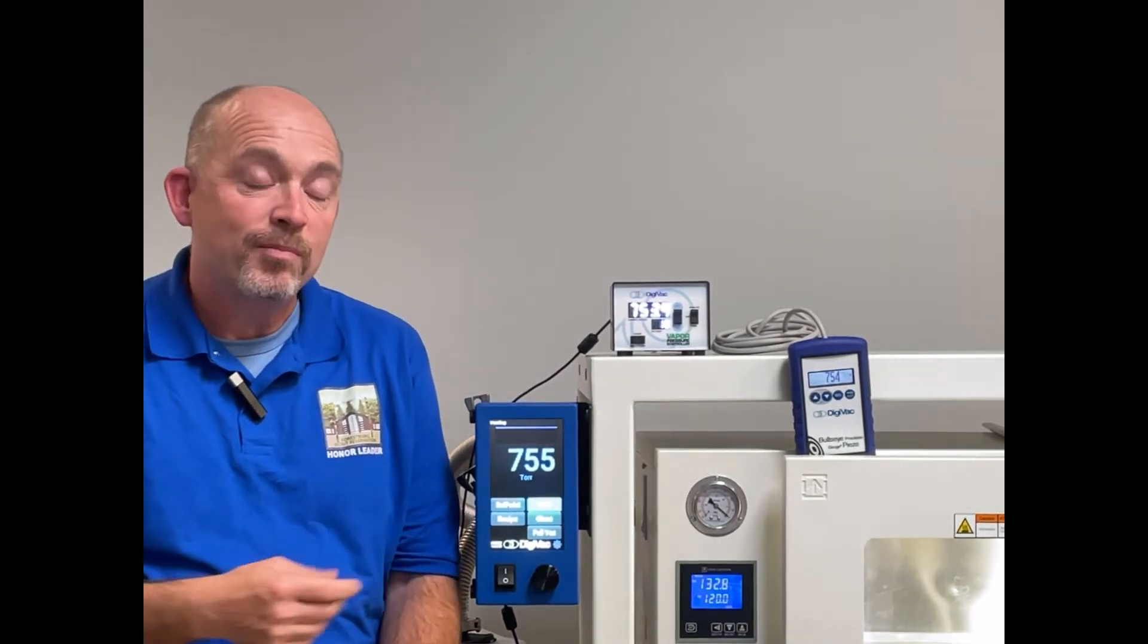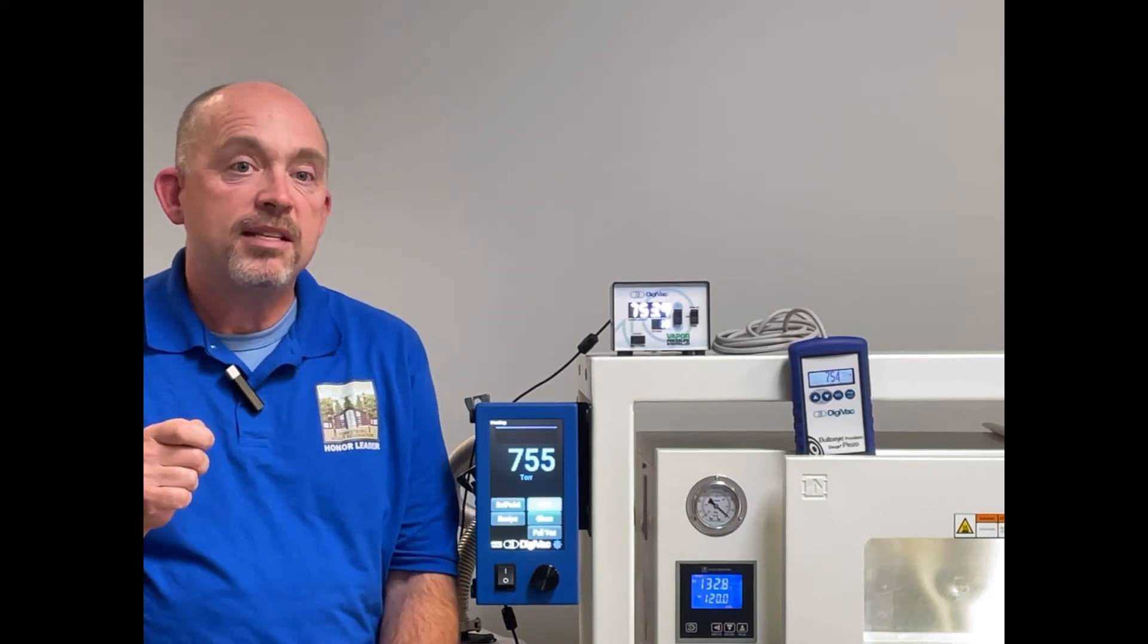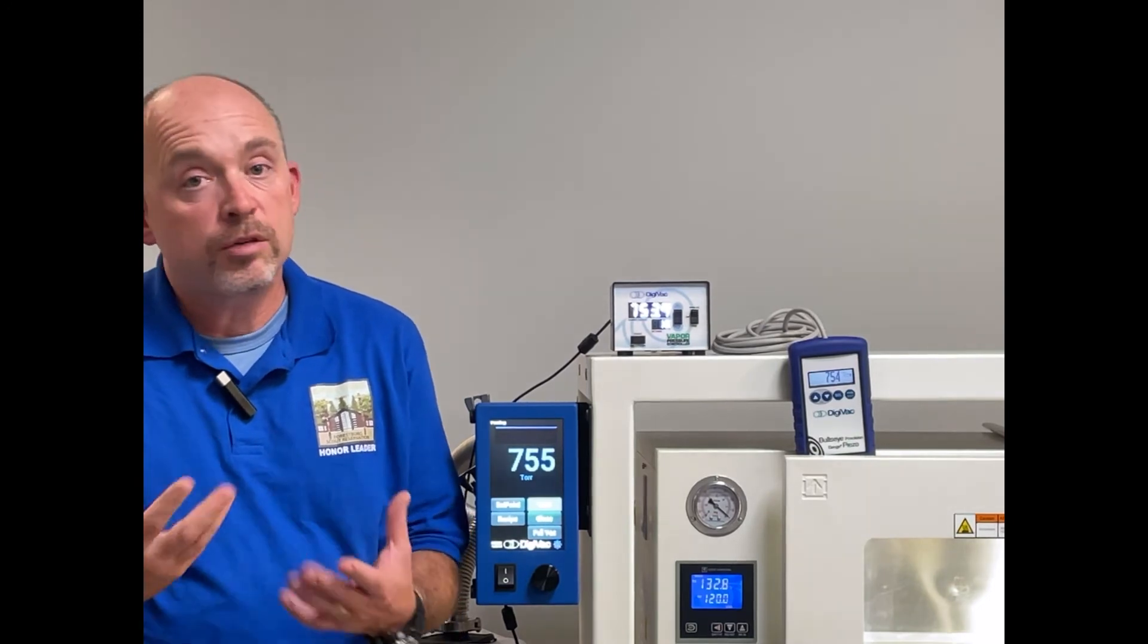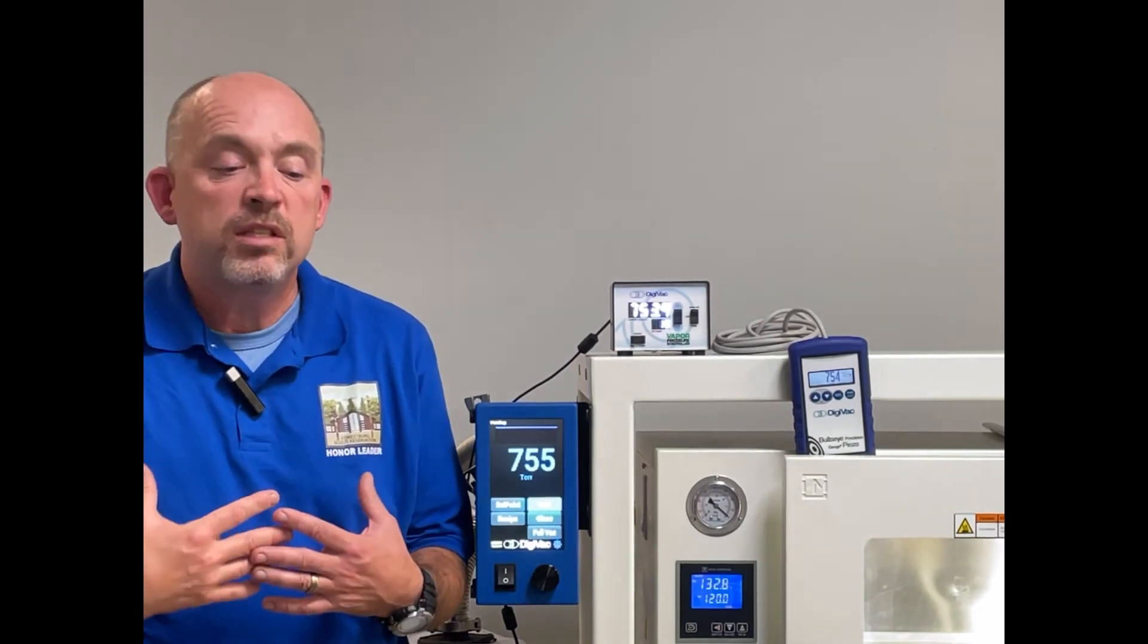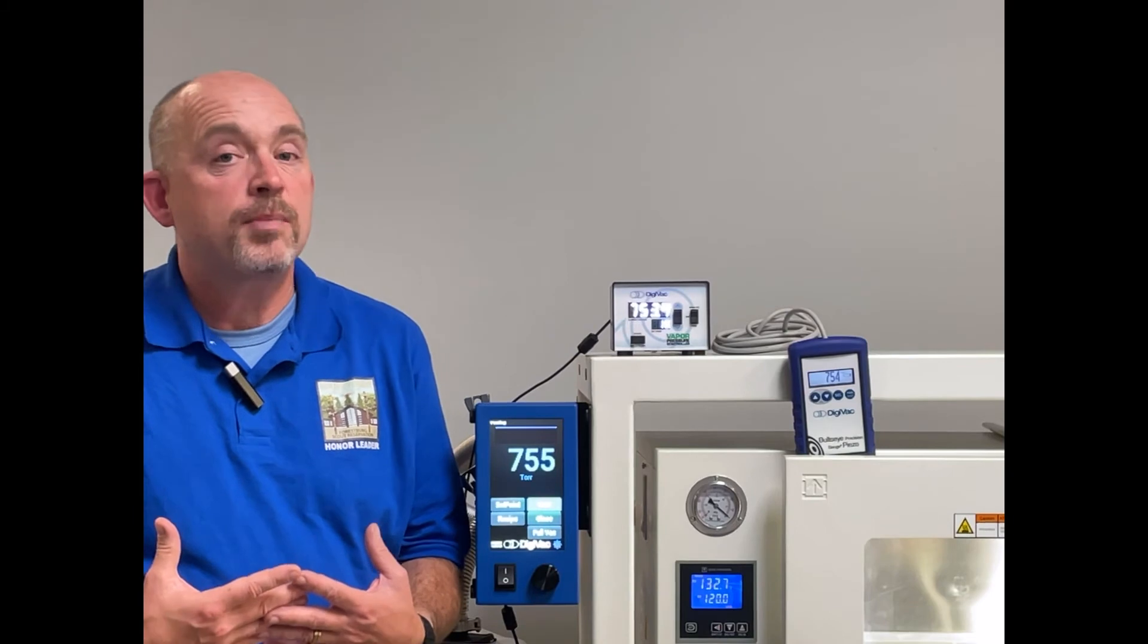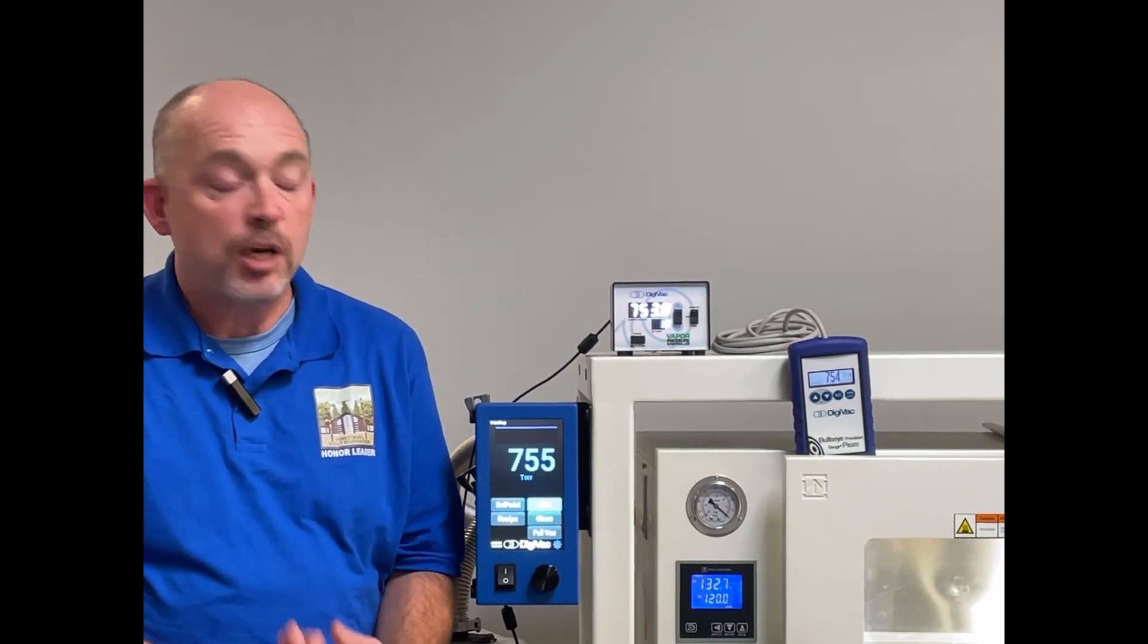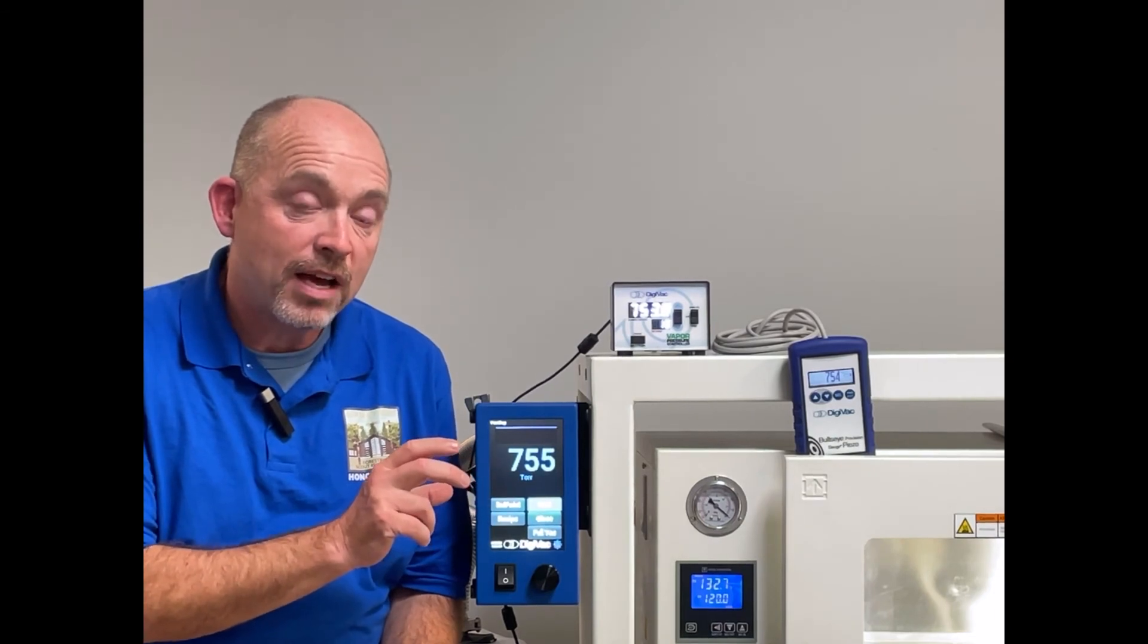The nice thing about that is it's a very automated way to make sure powders don't end up in your vacuum pump. When someone's doing something manually, especially something as boring as that, mistakes are more likely to happen when you're tweaking and making very small changes to valves.